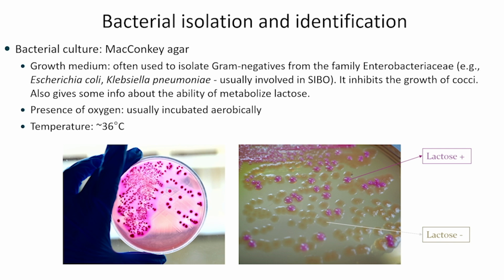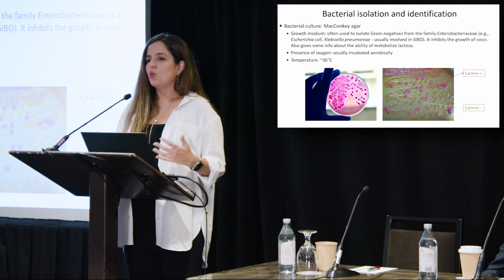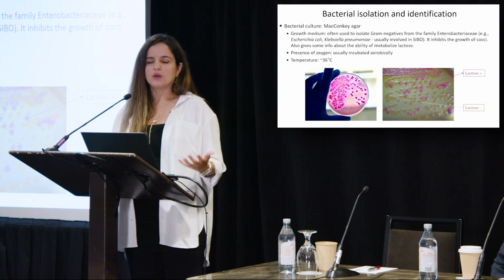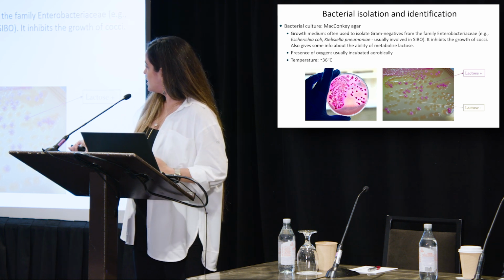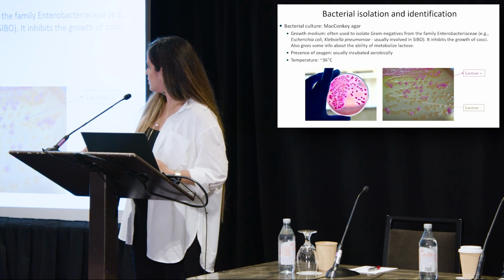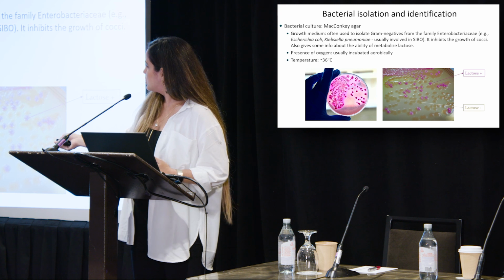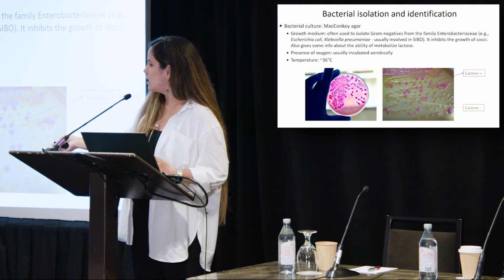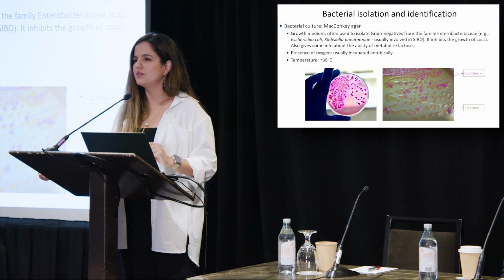We culture the samples, the aspirates that we collect from the small bowel, such as Dr. Rezaie showed you how we do, right? And we wait for them to grow for about 24, sometimes 48 hours. And then we see these little colonies. These are plates from real patients that we have in the lab. And we see these colonies growing. Like I told you, one colony came from one single microbe. And what we do next, we count them.